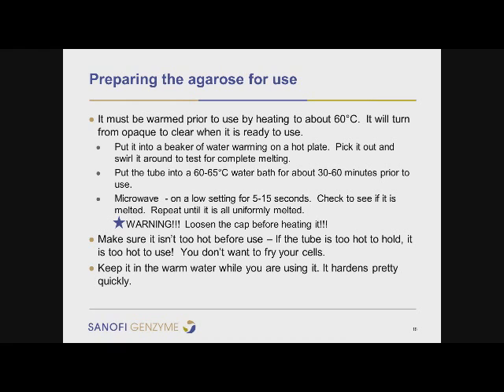It's really important to loosen that cap before heating it, because if you don't, the cap will pop off. Kind of sounds like popcorn if you have multiple tubes in there, and you may scare your lab mates. So I only do it 5 to 10 seconds at a time, and you need to check if it's melted in between. And you just repeat it until it's uniformly melted.